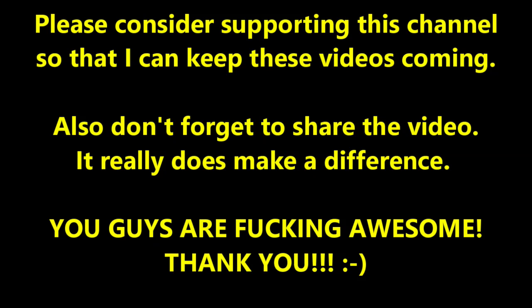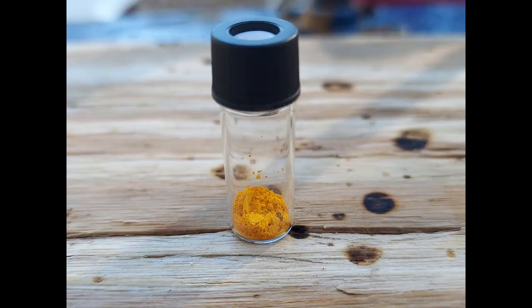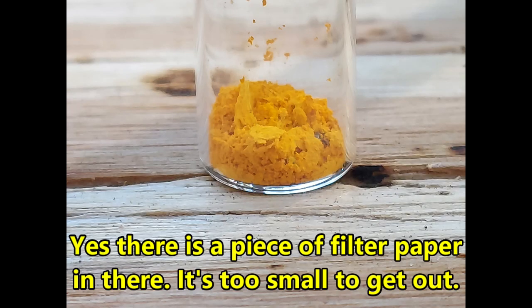Hello everybody and welcome to the Poor Man's Chemist. In this video I'm going to be doing a melting point analysis on the experimental benzaldehyde dinitrophenylhydrazone that I obtained from my benzaldehyde prep.